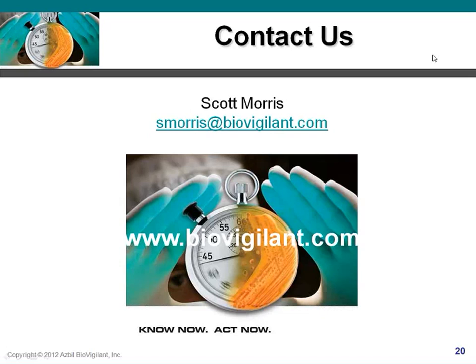And what is involved in that is either an on-site recalibration or shipping the instrument back to BioVigilant, where we perform a number of diagnostic tests and run a series of calibrated reference particles through the system. Not unlike the aerosol challenge that I talked about using microbes for validation, we have specific microspheres, little plastic particles that have traceable amounts of fluorescence in them. And we can run those through the system to measure and ensure the system is operating nominally. And so like I said, we recommend that that's done once per year.